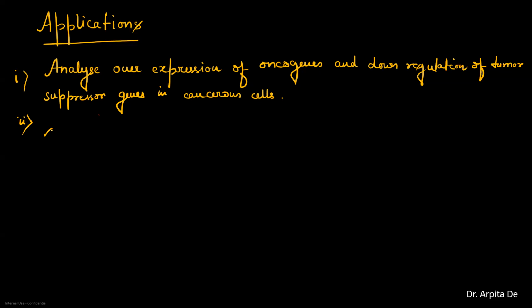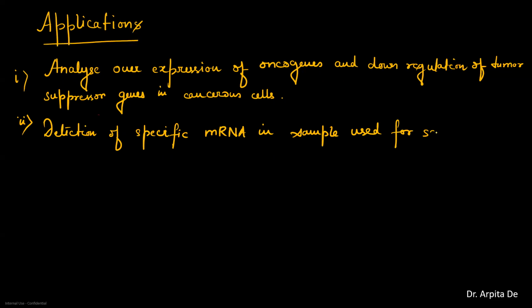Next, you can say detection of specific mRNA in a sample, used for screening. The sole purpose behind writing these out again is to make you write. While you are going through this video, please pause the video and take it down as notes. Just don't gaze through this. It won't help. Practice writing. The more you write, the better it becomes. Please write it.